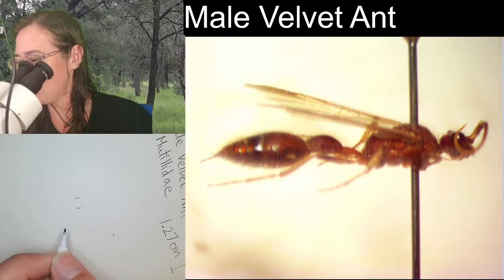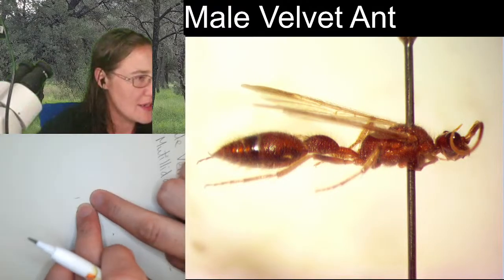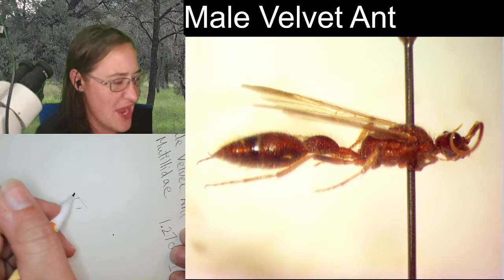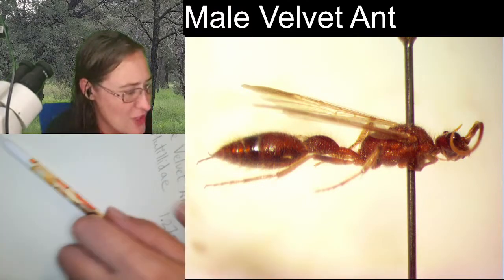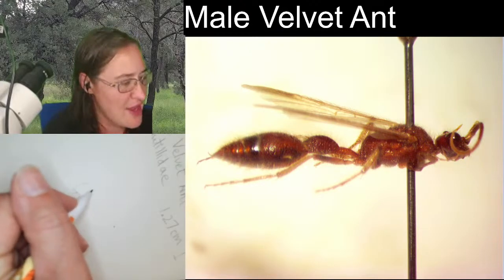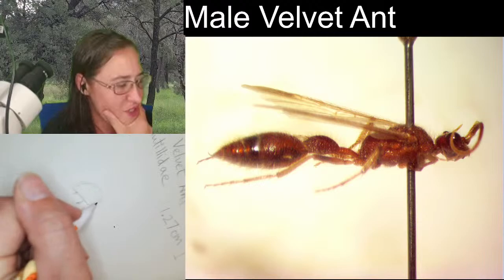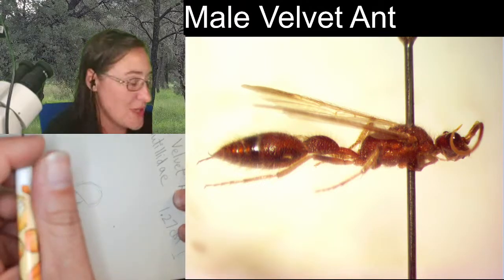All right, the back of the head, or the side that's closer to the thorax, is on a little bit of an angle. It's on this angle. All right, and then I'm just going to start it on that angle and then round it off fairly circular. We're going to get rid of some of those sharp edges when we zoom in, I assume.